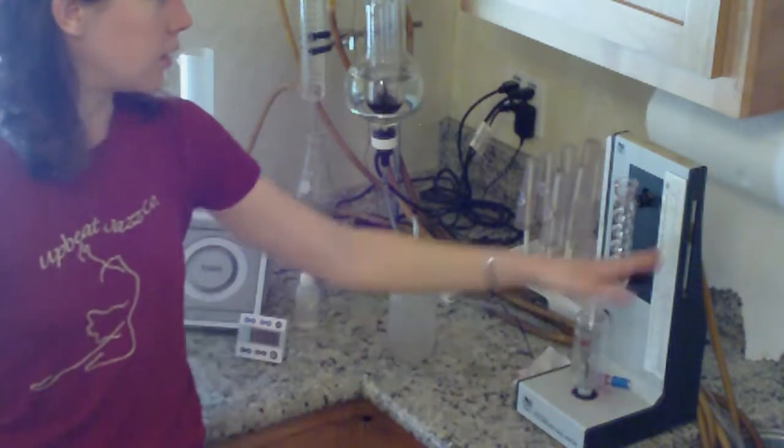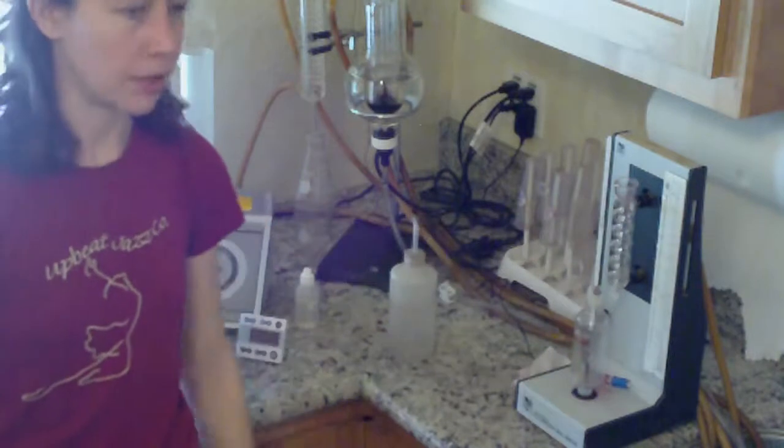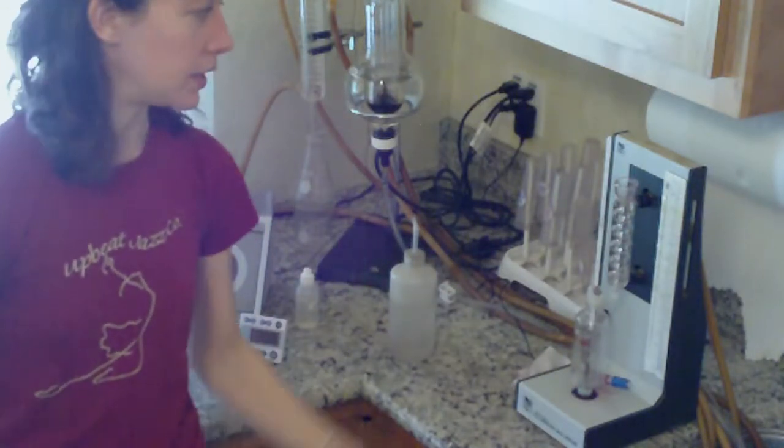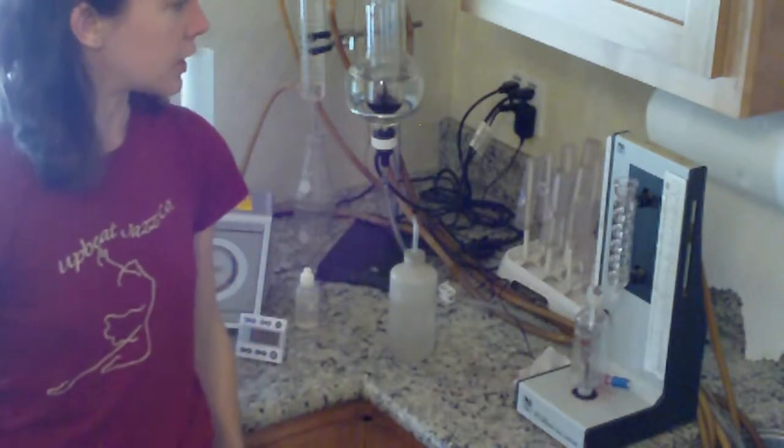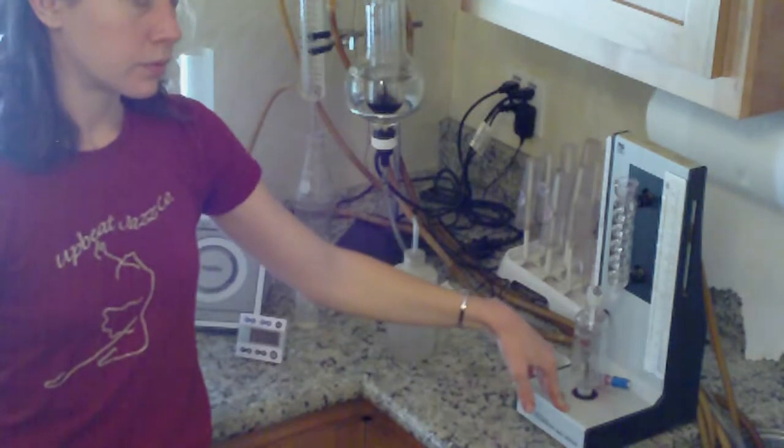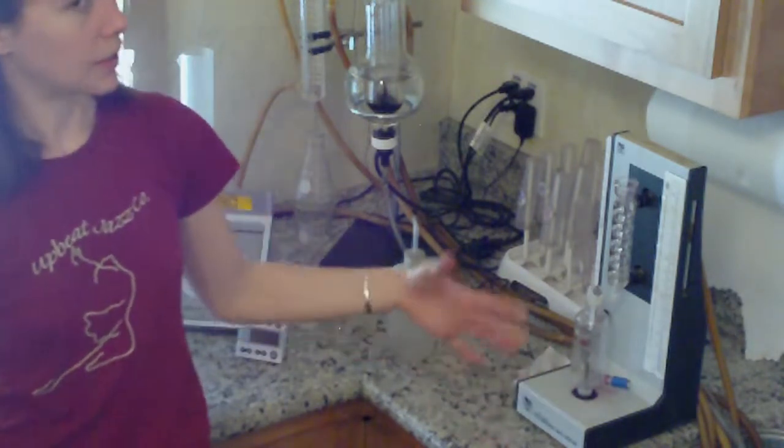Yeah. Well, I mean, you calibrate with, you find out what the boiling point of the temperature is of the distilled water. And it's a little different every day because barometric pressure changes. So the atmosphere pressure actually will affect this test? Yeah. That's how I understand it.